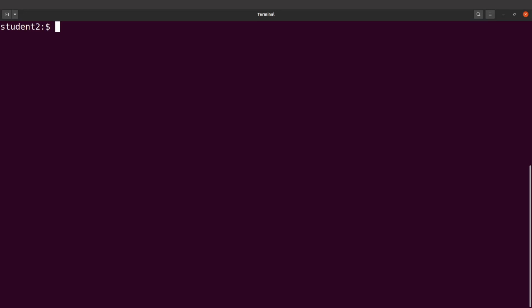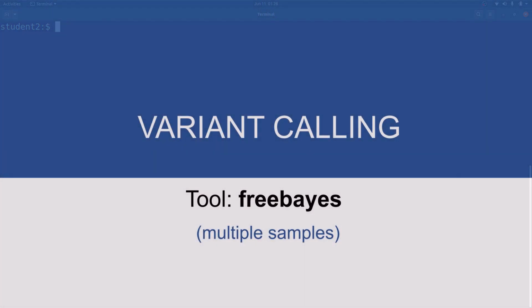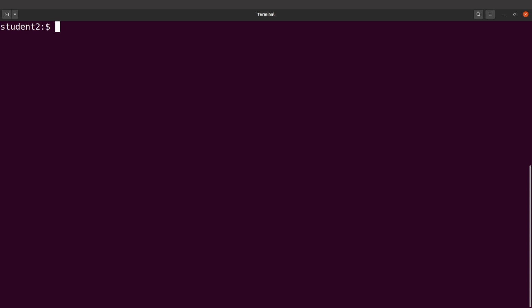Hi everyone, welcome to the second episode of the tutorial on variant calling using Freebayes. In the first episode, I showed how to call variants using Freebayes from a single sample. In this tutorial, we are going to call variants from multiple samples. So just make sure to watch the first episode if you have not done so. So take note of that.